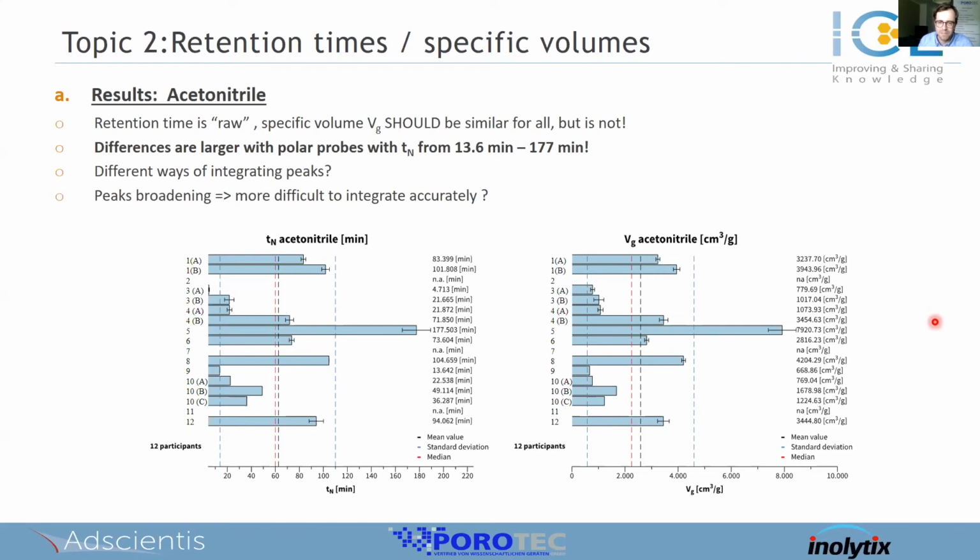But again, this was the most complex molecule in these investigations. Don't be afraid in your analysis, as single molecules can be excluded from your analysis. We also got good reliability for polar probes, but we can learn more from these differences or complicated molecules than just showing the easy and measured without problems probe molecules.